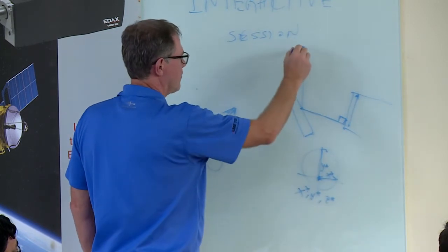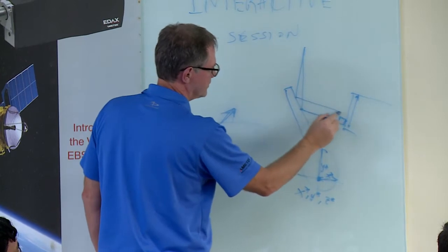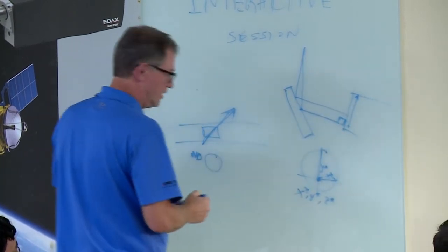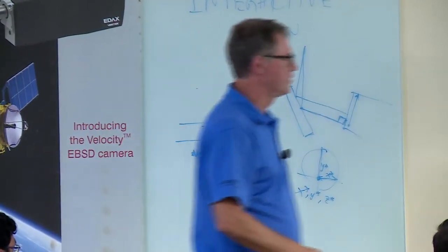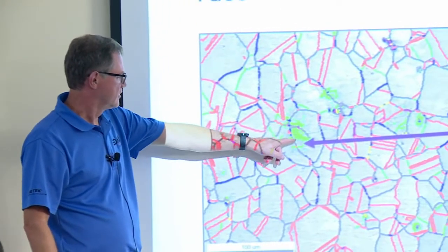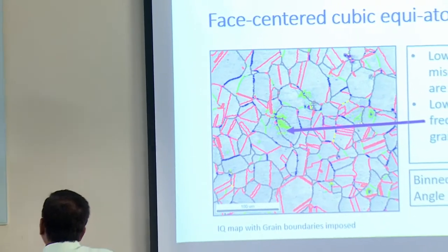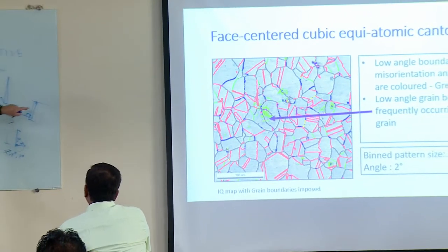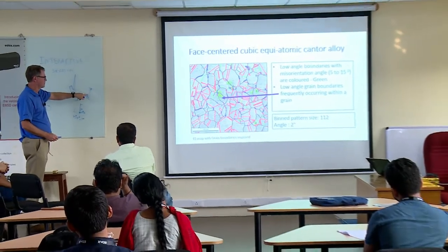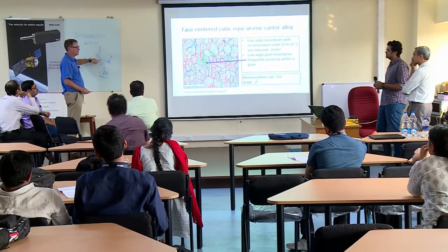And so then you can imagine we deflect the beam, right, to do a scan slightly. And so what happens is now it's changed in Y star. And what I've seen when I've looked into these problems closely, and I'm actually working on this right now, trying to improve this, is when I see something like this, it sometimes means that something's gone wrong. So we have an algorithm that figures out what this change is. And we seem to have a problem that in some areas it seems to be going wrong. It can also mean that our original one we base it off of is slightly off.